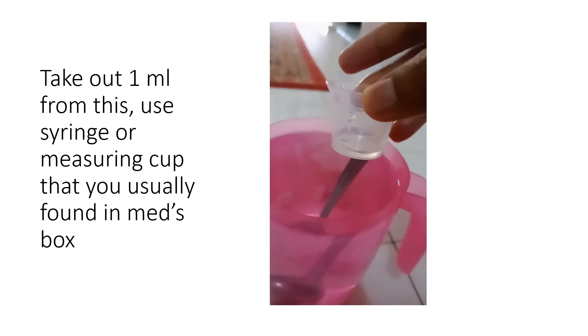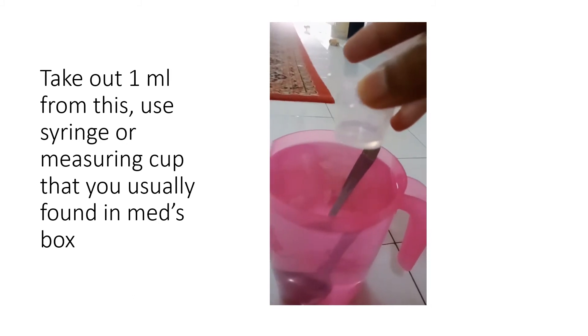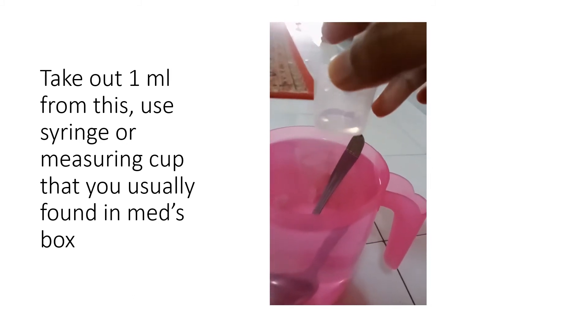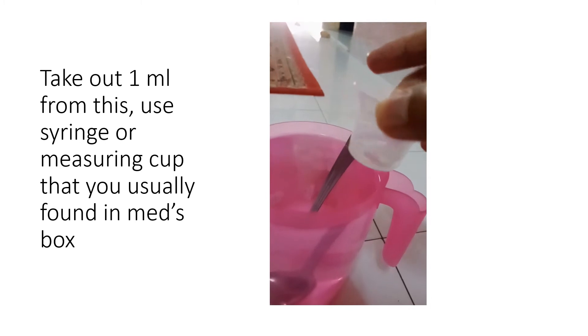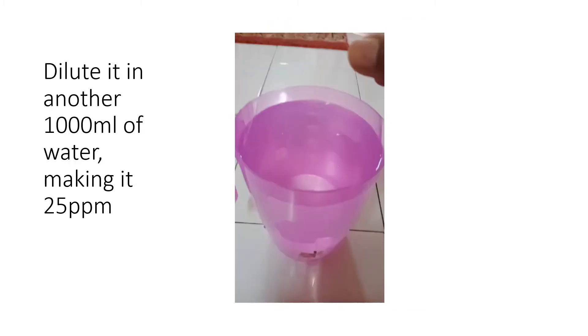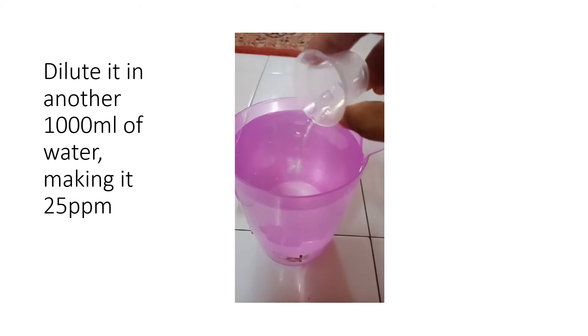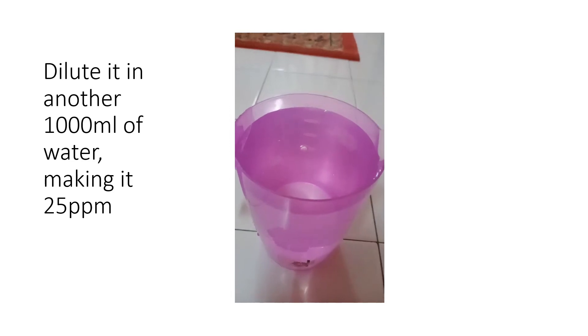I have already measured one milliliter of salt water using my medicine cup. Previously we dissolved 25 grams into one liter, which makes it 25 parts in 1000. I'm going to take 1 milliliter and dissolve it in another liter of water to make it 25 ppm. Drop 1 milliliter of the salt water into 1000 milliliters of water.